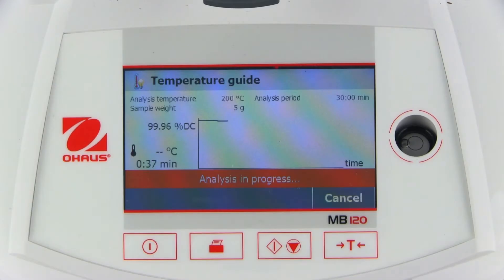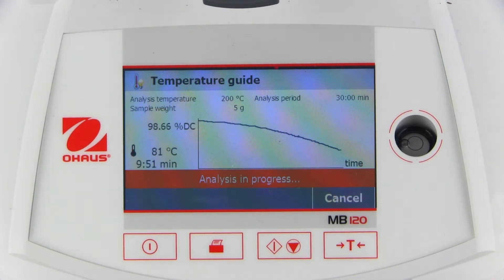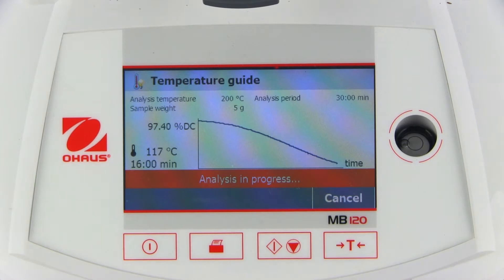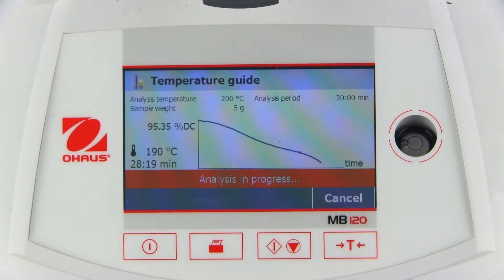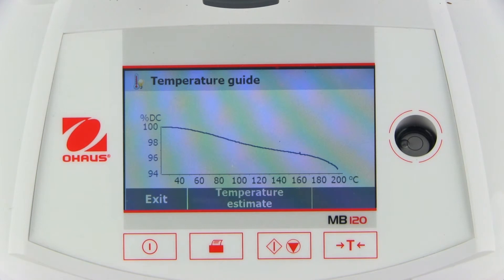A 30-minute measurement will now start, slowly increasing the temperature to the maximum analysis temperature while showing the dry content of the sample. Once measurement is complete, a graph showing the dry content change over time and temperature is displayed.